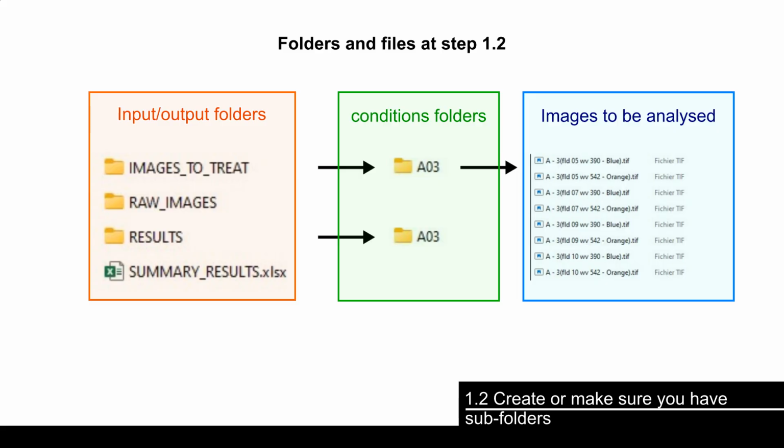You should have your input-output folders, here named images to treat and results. In these folders, you should have the condition folders, here named A03, but it can be whatever your condition names are. And the images to be analyzed have to be in the condition folder of the images to treat.